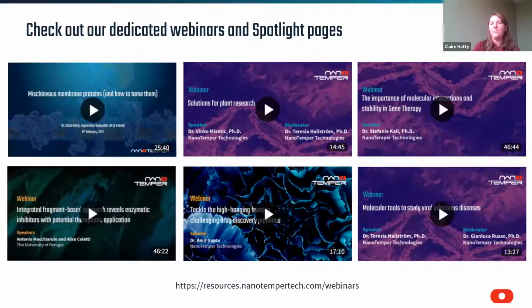That's a brief overview of some of the different types of interactions that you can measure with MST and TRIC. I just wanted to pause for a moment before moving on to some screening examples to point out that we have many more in-depth webinars on our website. You can look at topics like membrane proteins, plant research, gene therapy, virology, fragment screening, and compound screening in more detail.